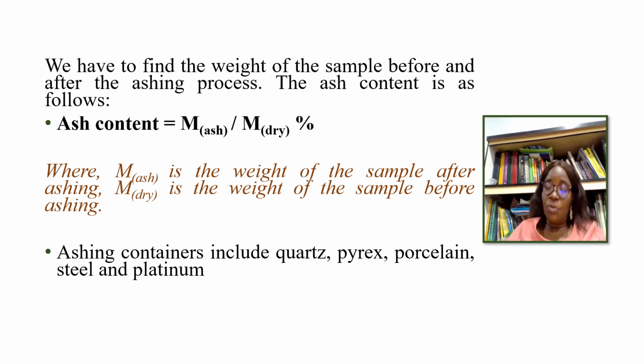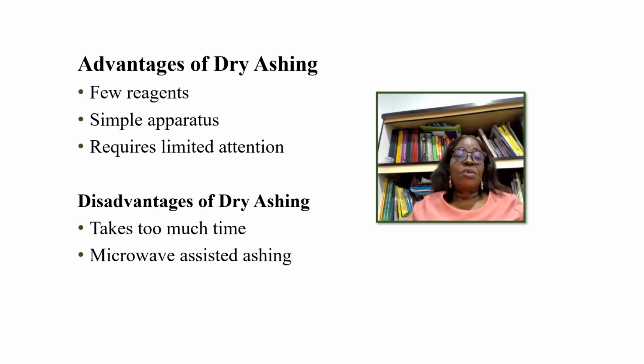That should be noted. There are sources of error in dry ashing, and this could be as a result of the analytes reacting with the crucible material. The extent of losses depends on the temperature, the crucible, the chemical composition, and the sample. Silicates, phosphates, and oxides, for example, can react with the crucible porcelain enamel, and it is advisable to use crucibles made of quartz or platinum. Always note that you must find the right crucible for the drying of your material to avoid errors.